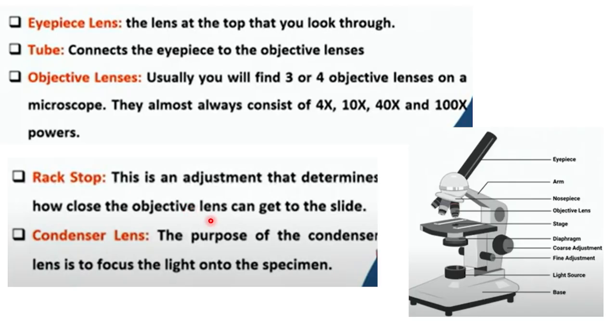And there is also the condenser lens. The purpose of the condenser lens is to focus the light onto the specimen.